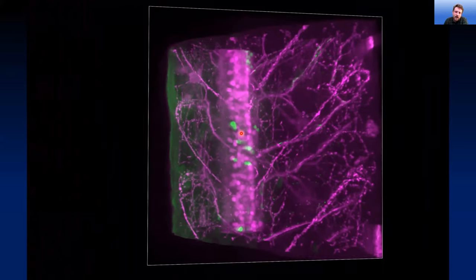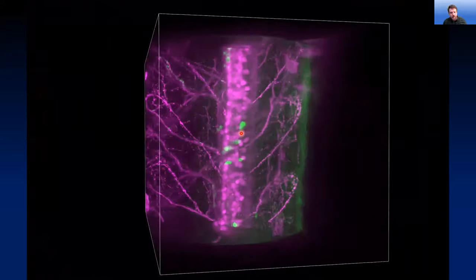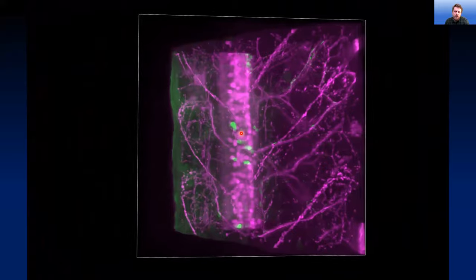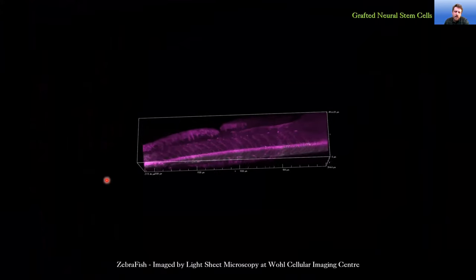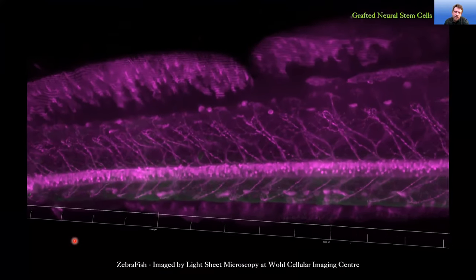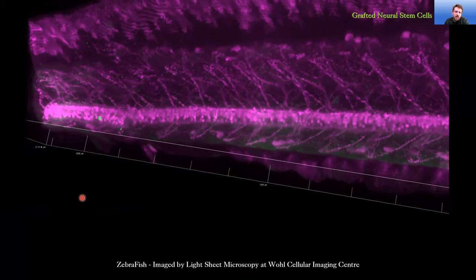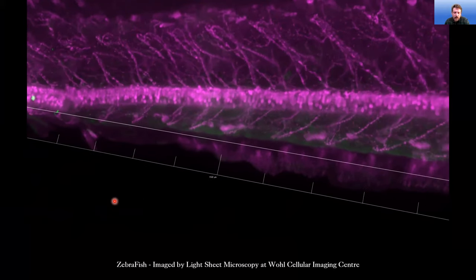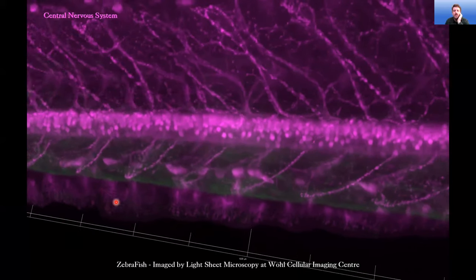Again, it's just to highlight that light sheet microscopy really benefits if you want to gather much larger volumes quickly. Just to go back and play this again, these four fields of view that were stitched together, we obtained probably in about 5 to 10 minutes with two channels, and it's 300 to 400 microns of data. So yeah, if you did that on a confocal or multi-photon, you're talking hours. So again, that really highlights the benefit of speed there.